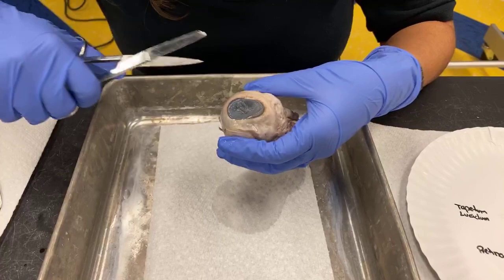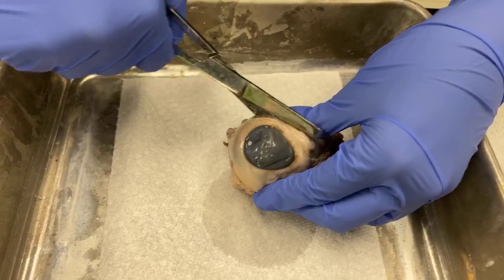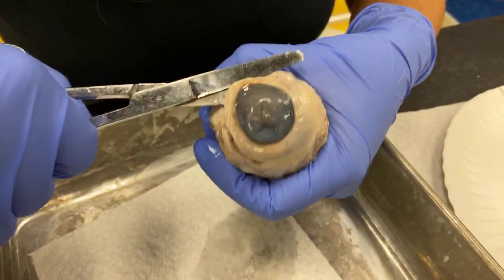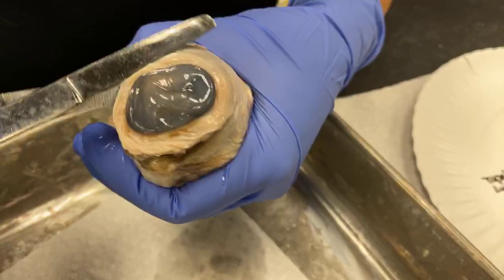We're going to go ahead and cut into the eye so we can see some more parts. If you want to try something like this on your own, you'll probably get to do it in your science class, maybe in middle school or high school, or in an anatomy class. You can also try it online — there are some good digital resources for dissecting different things. What I'm doing is cutting around the cornea right in the middle of the sclera.